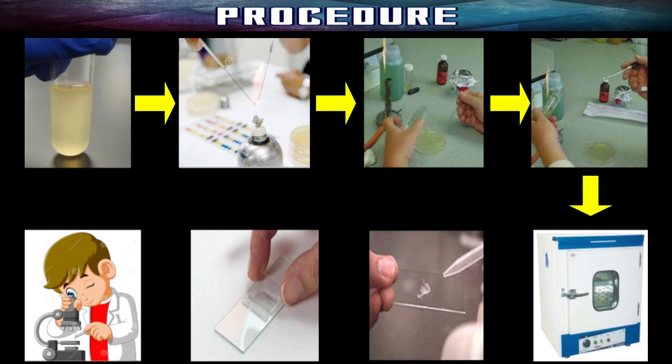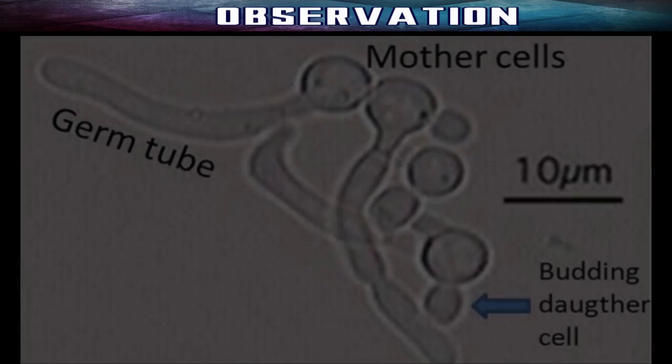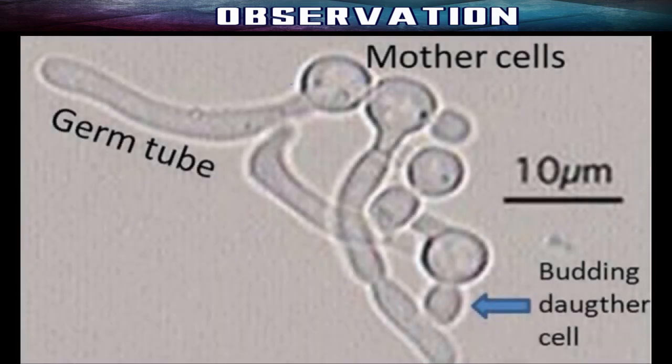And then incubate the tube at 37 degrees Celsius for about 2 to 4 hours. After that, transfer about a drop of the serum to a clean glass slide for examination. Then place a cover slip on top of it and examine under the microscope at low power and high power objectives. Coming to the observation, under the microscope, what you will see is the yeast.